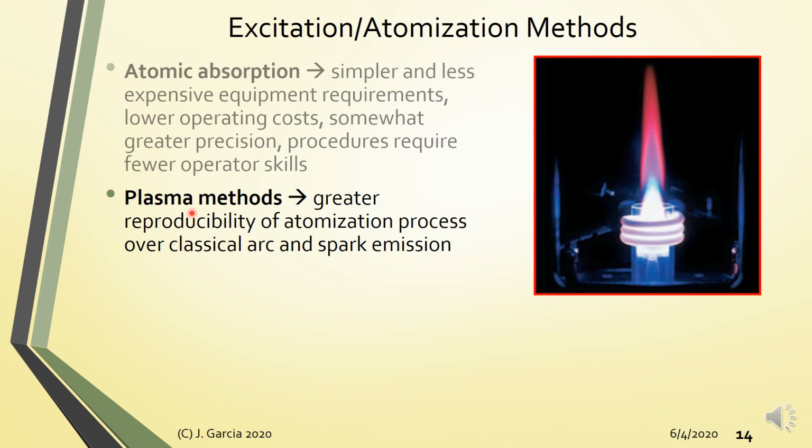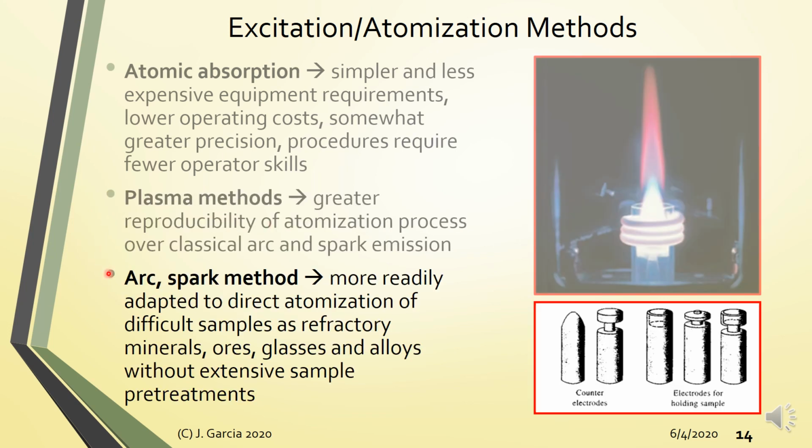So with ICP, you have instantaneous collection of results. All the elements present are instantly identified and quantified because of the multiplex design of your ICP system.